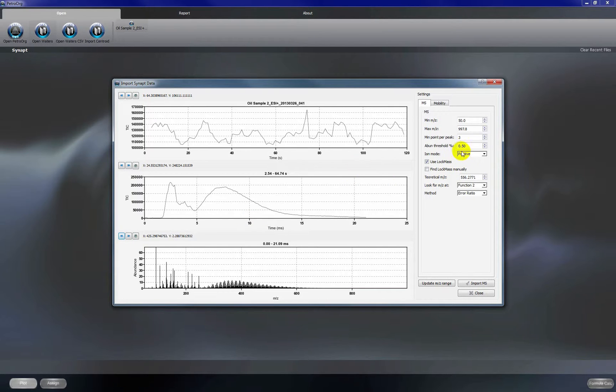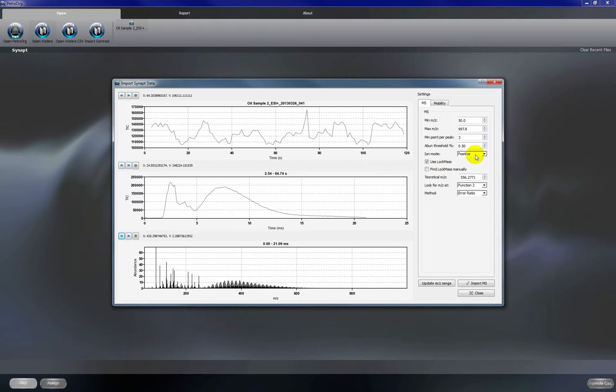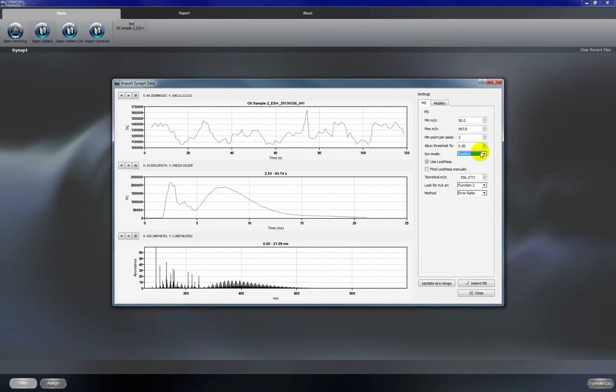We're using positive ion electrospray here so we're going to set this to positive mode. You can also select negative ion mode if you're doing negative ESI or negative APCI.